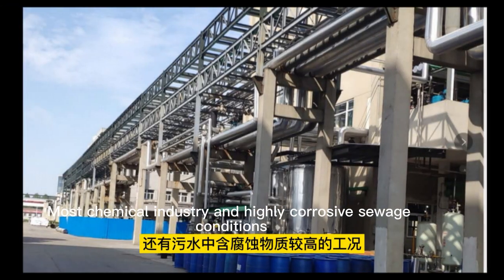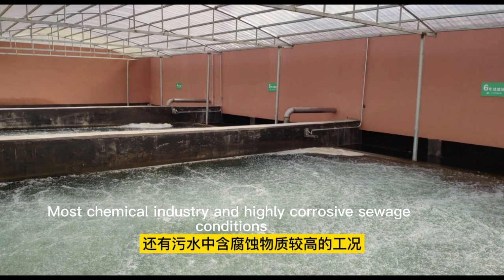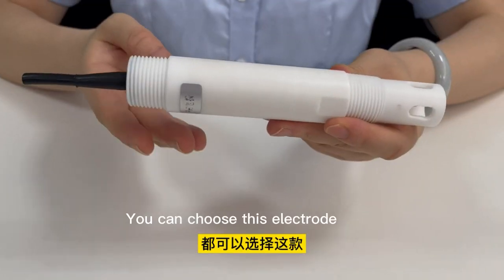Most chemical industry and highly corrosive sewage conditions — you can choose this electrode.